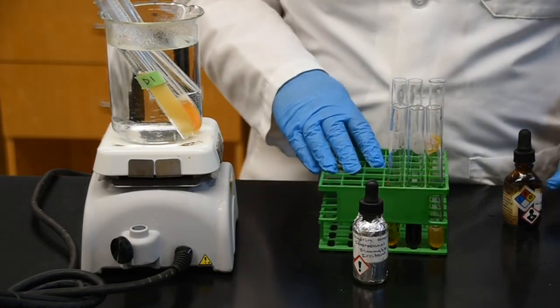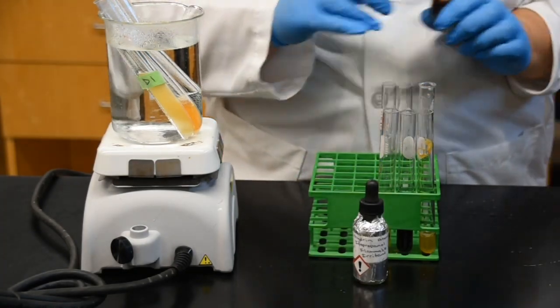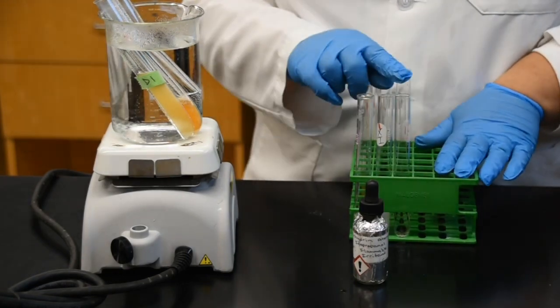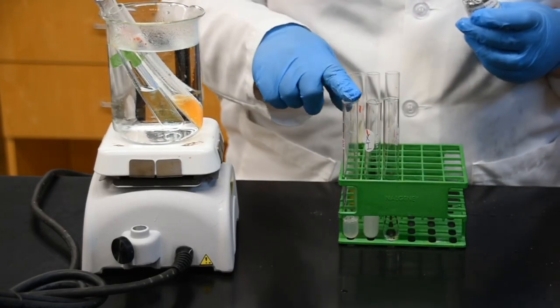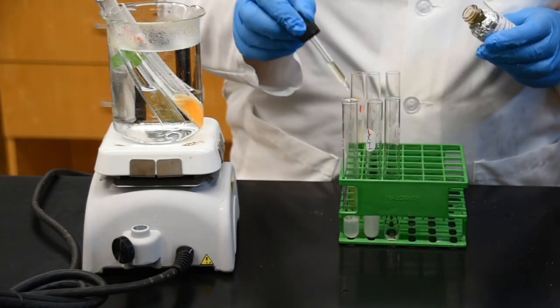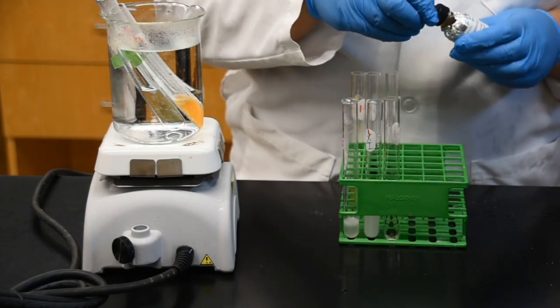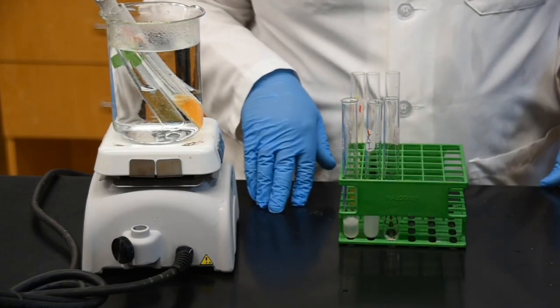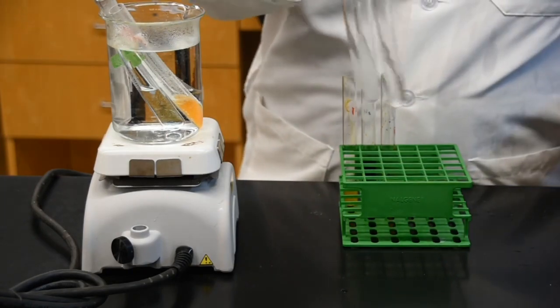So let's go ahead and take a look at our next test, which is going to be ninhydrin. I'm going to turn this around, and we're going to add our ninhydrin to our 3 samples. Again, we have a protein sample, a starch sample, and a simple sugar sample. So I'm going to add a few drops of this, a few drops here, and a few drops here. Please do note that ninhydrin is another sample that needs to be heated for us to see the reaction. So I'm going to mix these samples, and again, remember we're looking for a purple color.